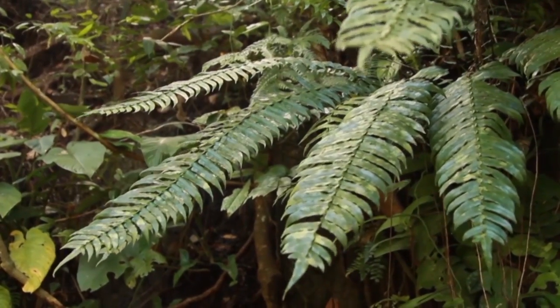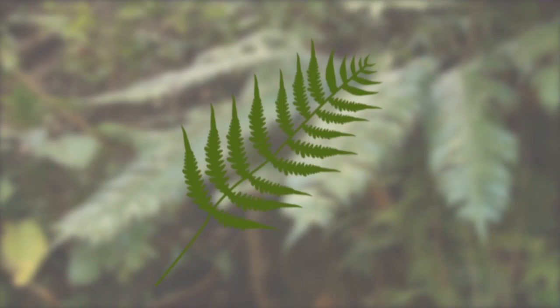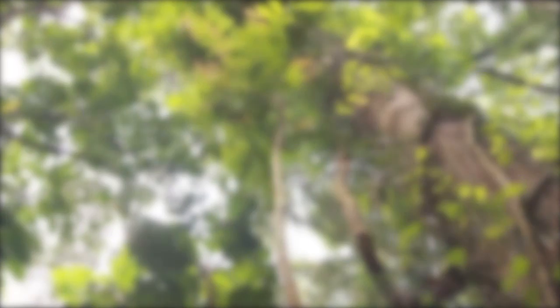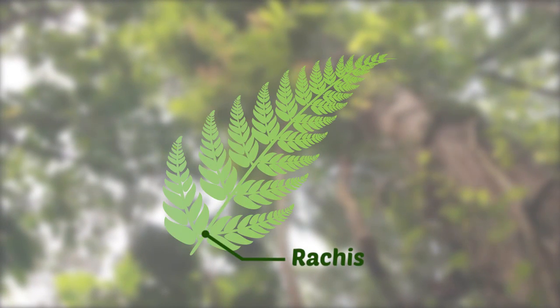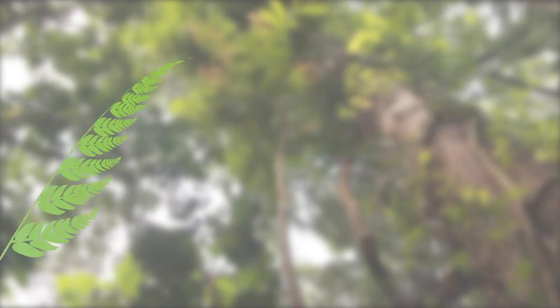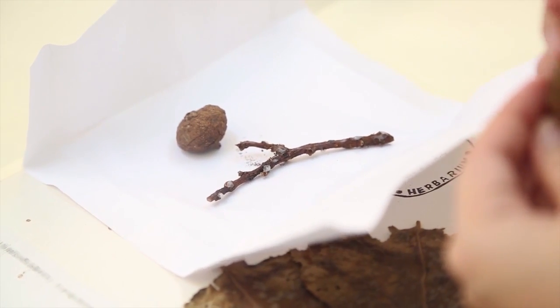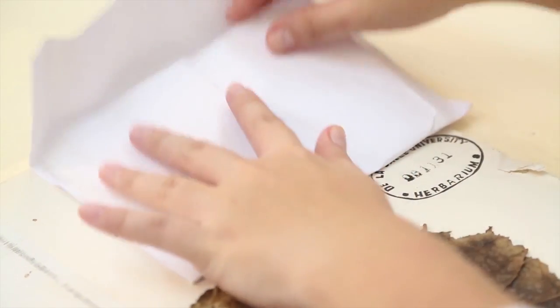Is your specimen too large for your press? Bend it into a V, N, M, or W shape. For large compound leaves, cut along the rachis lengthwise and use only half the leaf for the press. If part of the plant gets detached during drying, place it in a paper packet and dry it with the rest of the specimen.